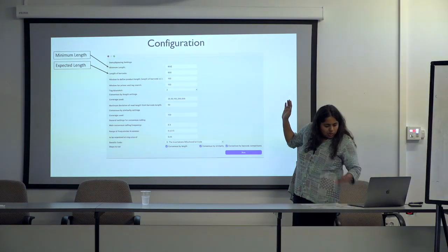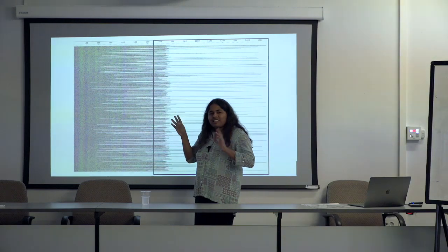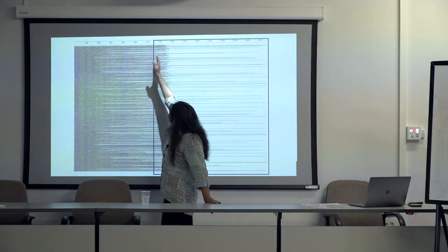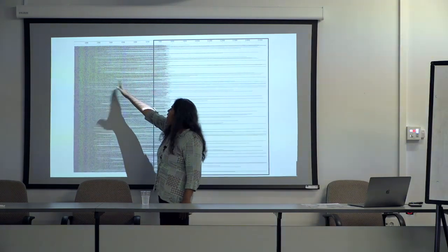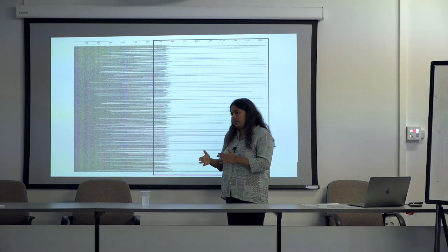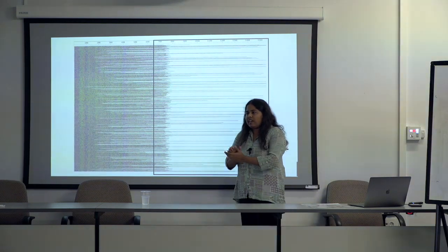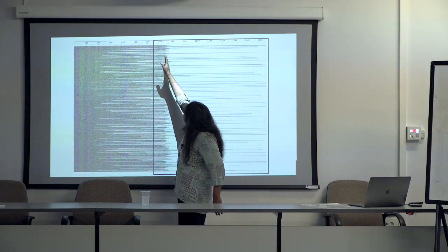So I'll just show you an image of how raw reads look. This is one of the worst data sets we had. So I thought we should start with why these parameters exist. You can see why some of the demultiplexing rates also fail, because you have a variable length. I think some of it has to do with existing primers not being removed. Some of it also has to do with terminated sequencing. So it's not that every molecule is sequenced to the end. So you get something like this.